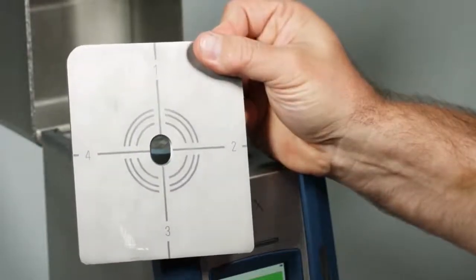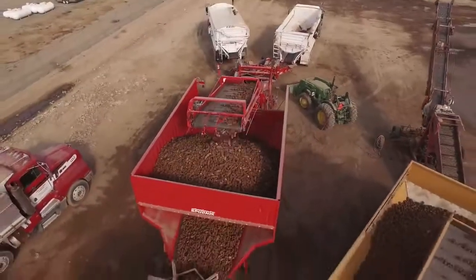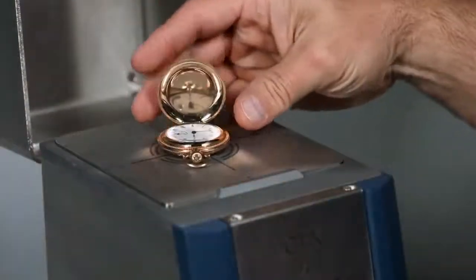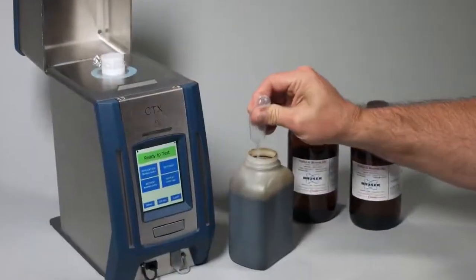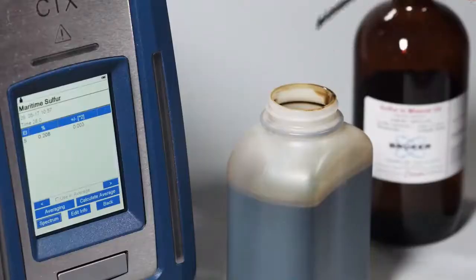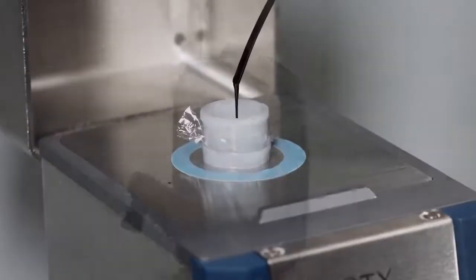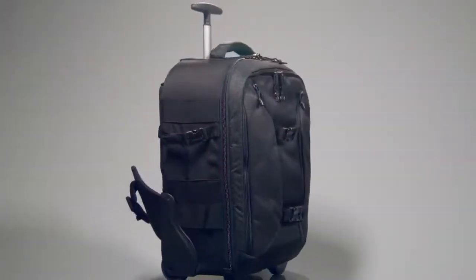From agriculture and food safety to mining and precious metals to energy exploration and metals in oil, the CTX fulfills the need for field portable elemental analysis of small and prepared samples.